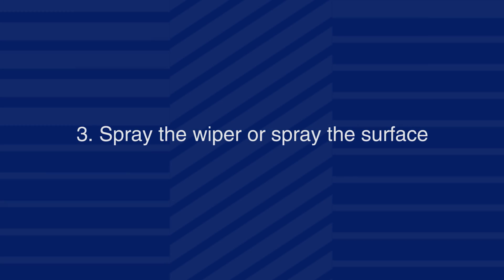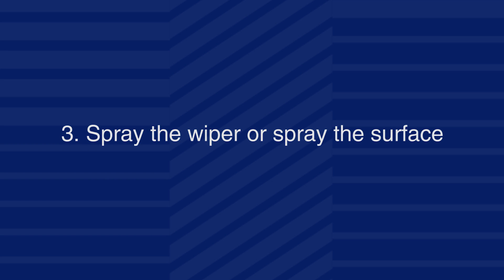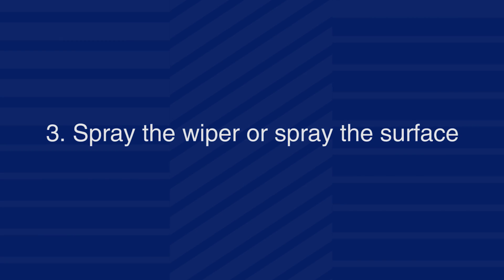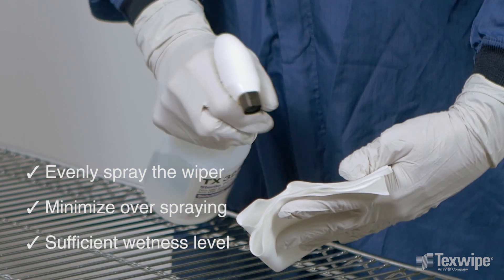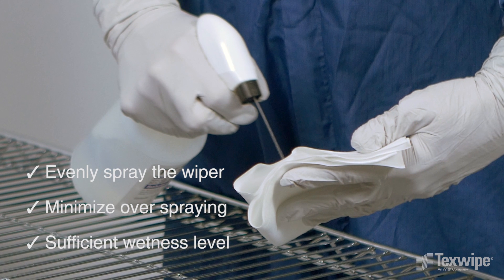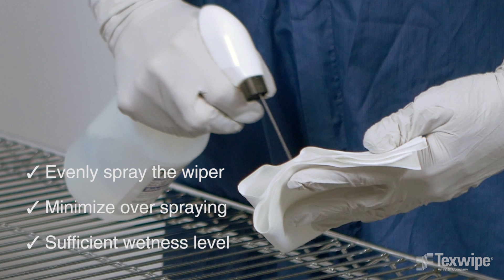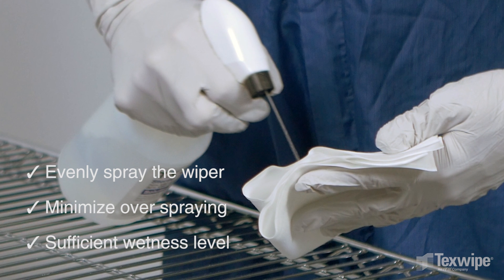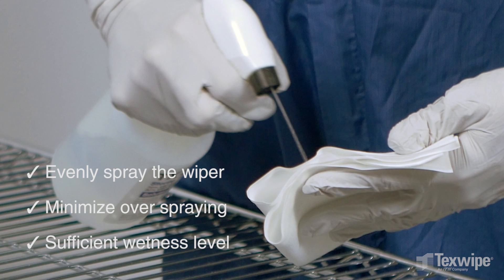Step 3: Spray the wiper or spray the surface according to your SOP, or skip this step if a pre-wetted wiper is used. Evenly spray the wiper by holding the nozzle at a distance to not create overspray. Minimize overspraying into the air or surrounding surfaces. The wiper should have a sufficient wetness level to leave a thin, visible layer of solution on the surface.